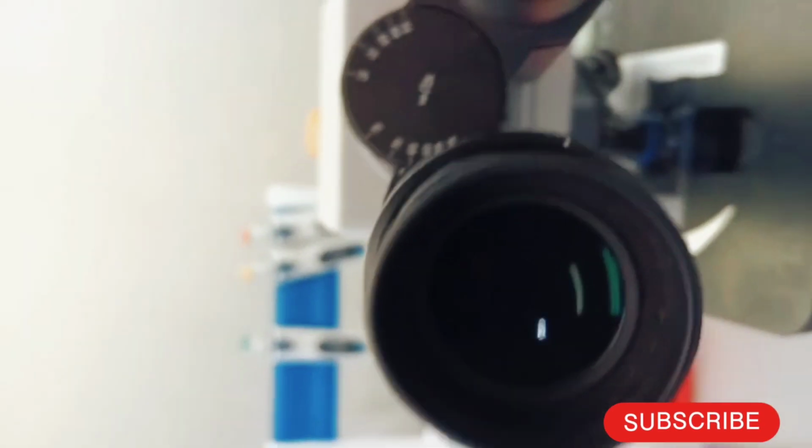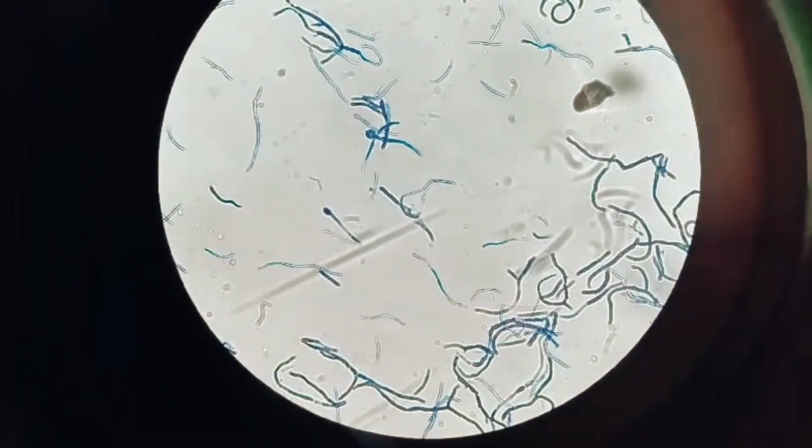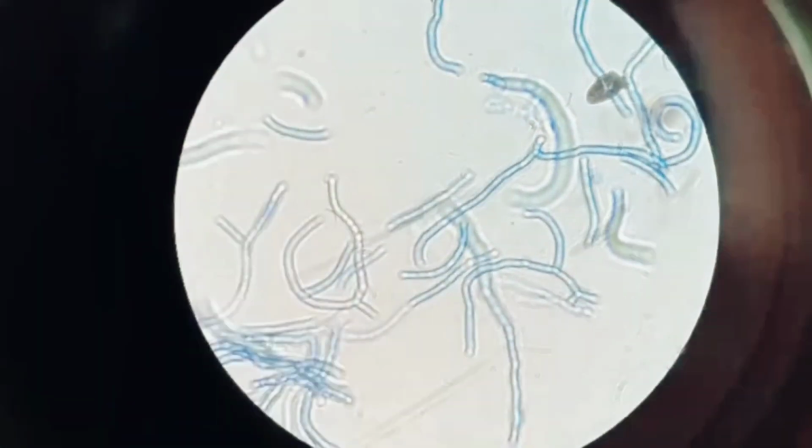At times 40, you're really starting to see distinguishable features. Ooh, look at them. So I added oil immersion to the slide so I can see at times 100. And look at these babies.